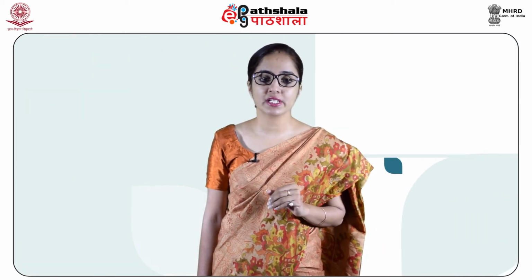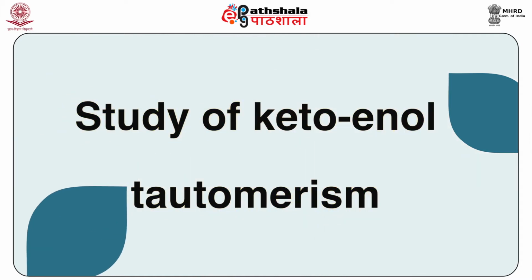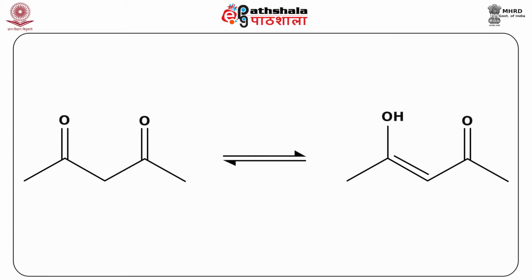Now let us move our discussion to the study of keto-enol tautomerism as an application of IR spectroscopy. IR spectroscopy is useful in determining keto-enol tautomerism.